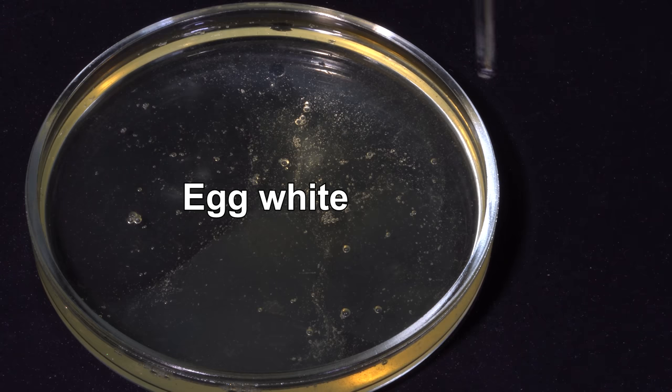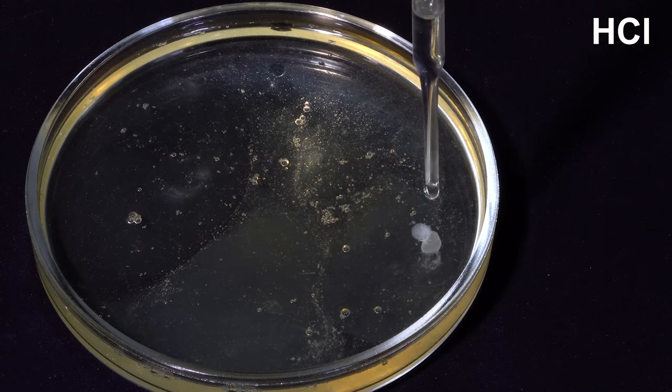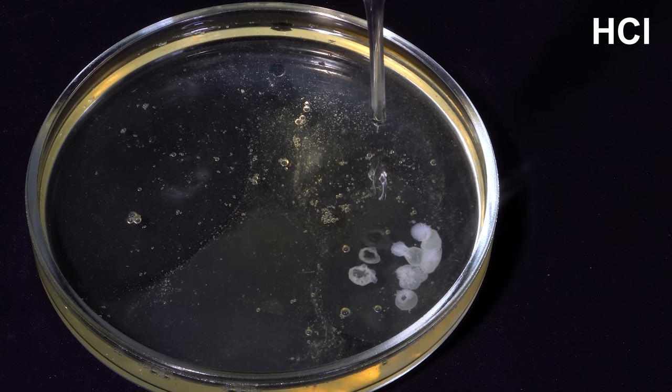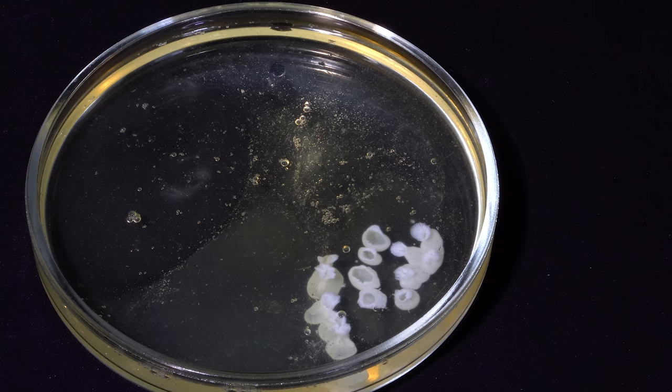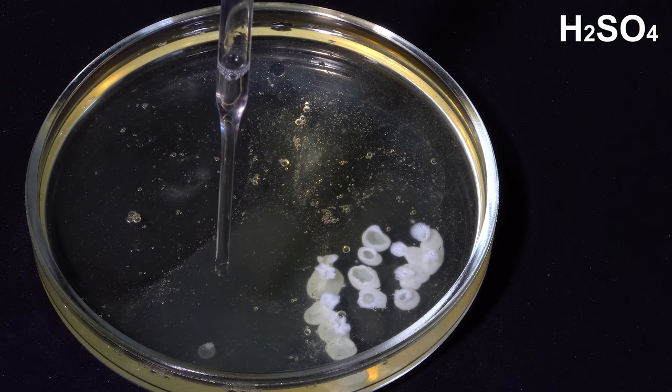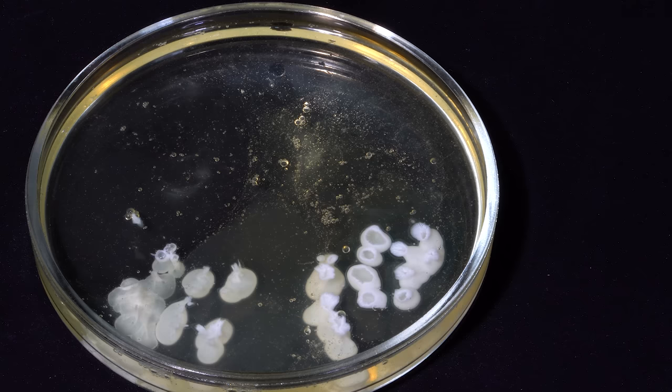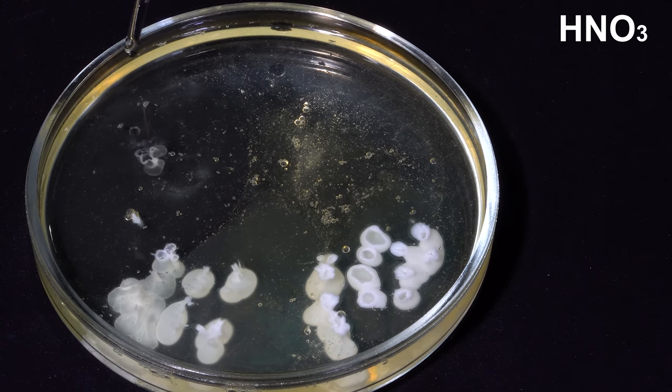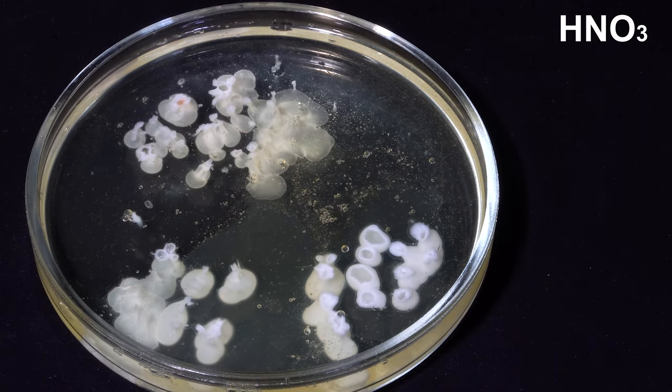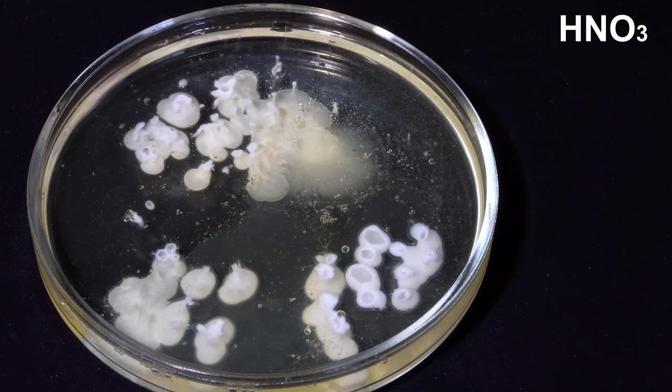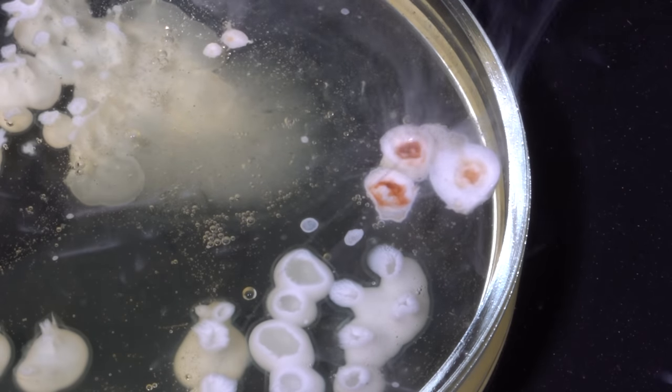Let's take a look at how an egg white will fold under the influence of various strong inorganic acids. Here I'm adding a few drops of hydrochloric acid, then sulfuric acid, then nitric acid. And to top it all, a few drops of chlorosulfonic acid. Take a look at the process of protein folding in slow motion.